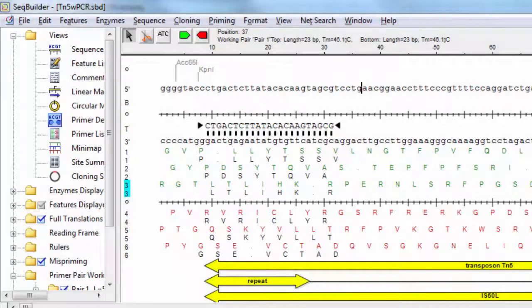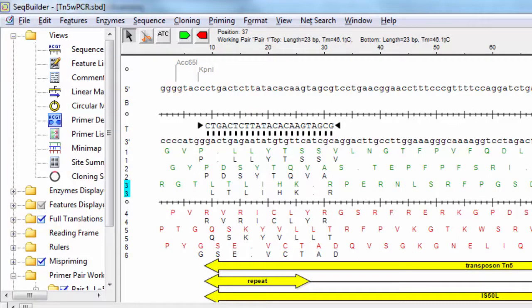The software also includes automated primer design tools for PCR, sequencing, and hybridization experiments.